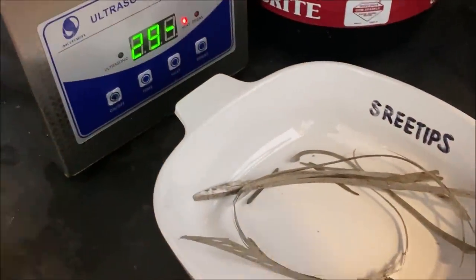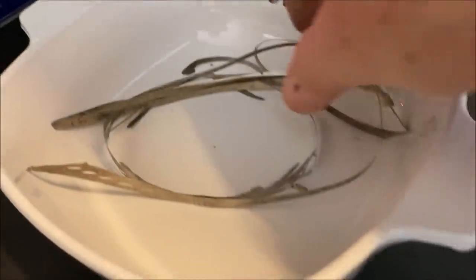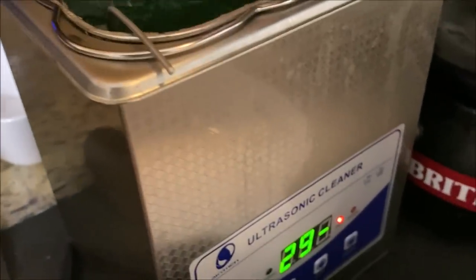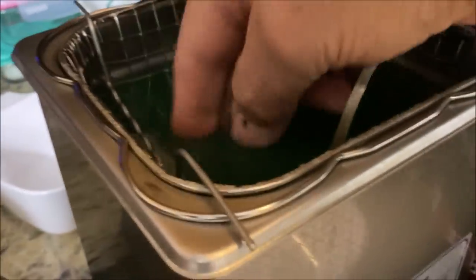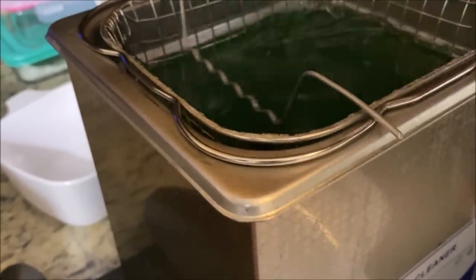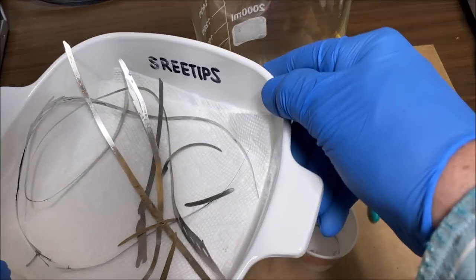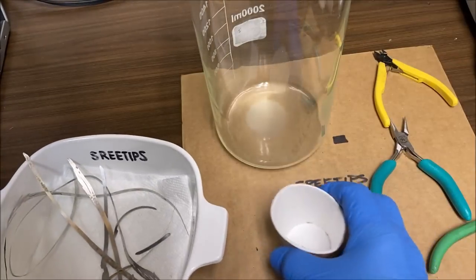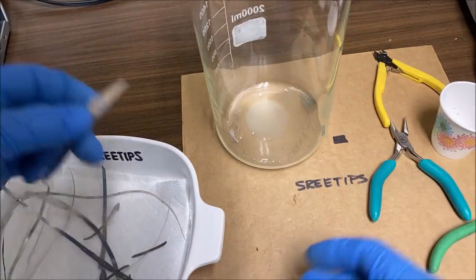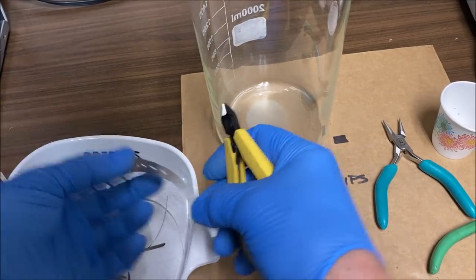I'm going to put these larger pieces into the ultrasonic and just let the solution in here kind of clean some of the junk off of these pieces of metal up here. I've got them cleaned up as best as I can. Now what we're going to do is add these small pieces right into this beaker. And then we're going to chop up these longer pieces into small pieces.